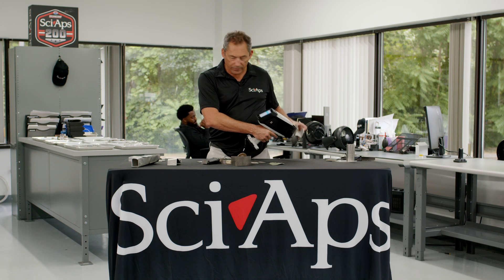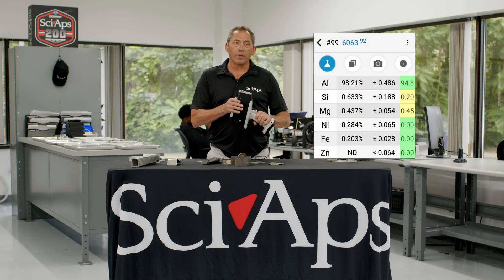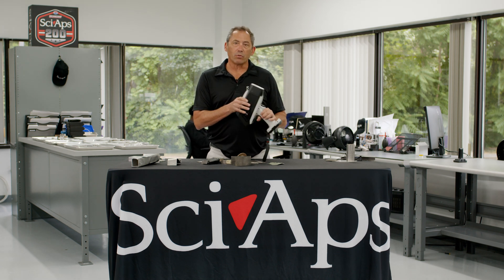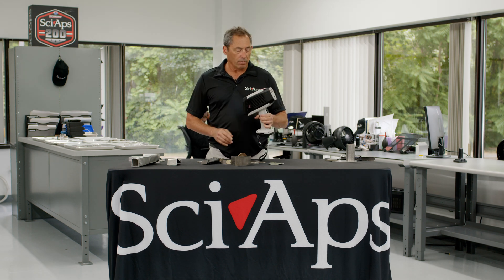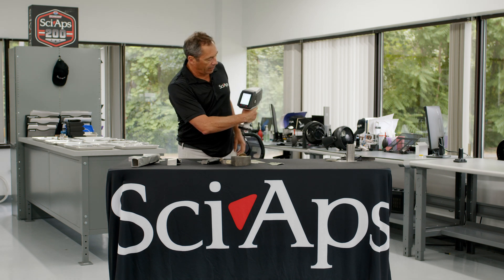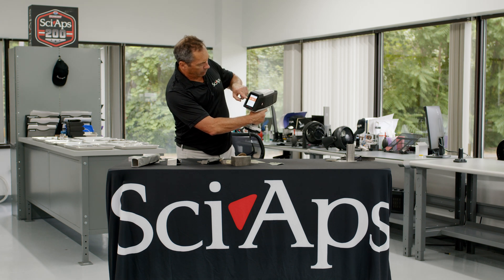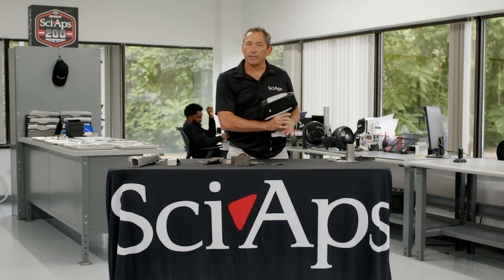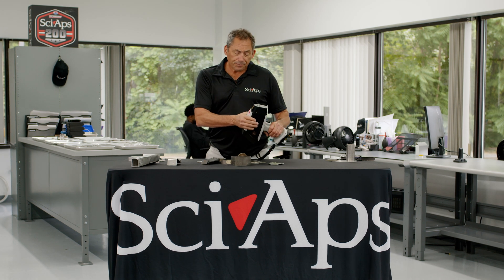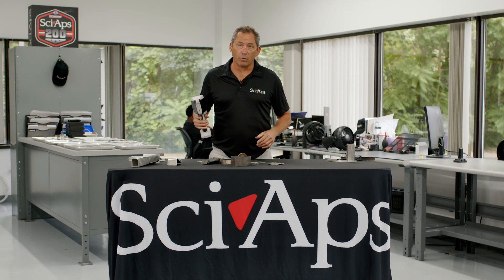One of the other neat things about this is it's got a nice safety feature. Even though it's a Class 3B laser, you can operate it under Class 1 conditions. If I just try to shoot this thing into the air, it won't fire — it just says 'no sample detected.' It won't even fire the laser. Because of that safety feature, which we patented, as an operator you can actually operate it as a Class 1 device.